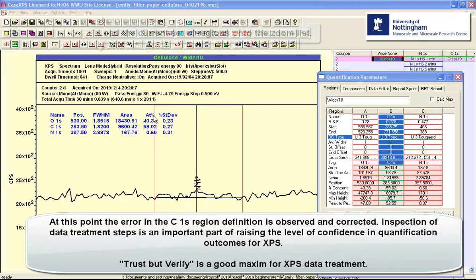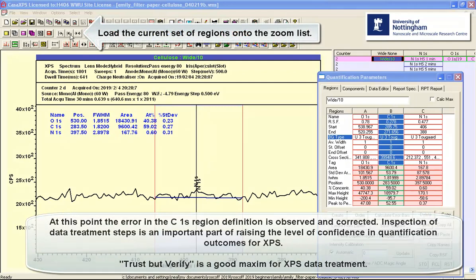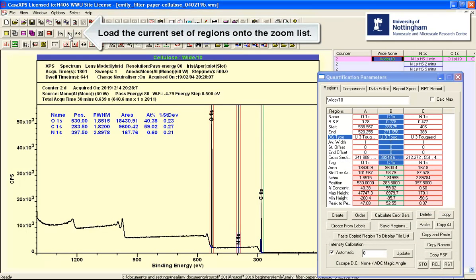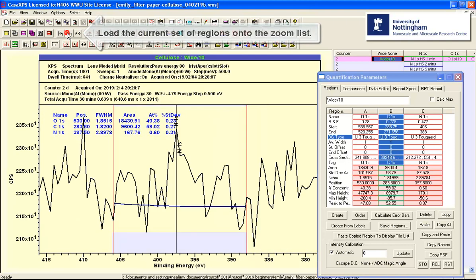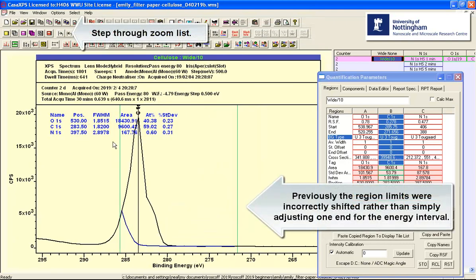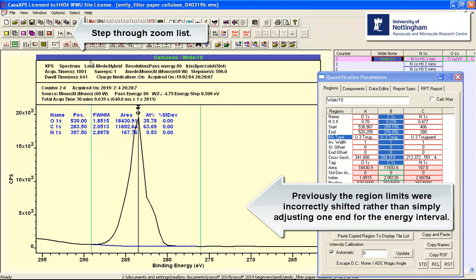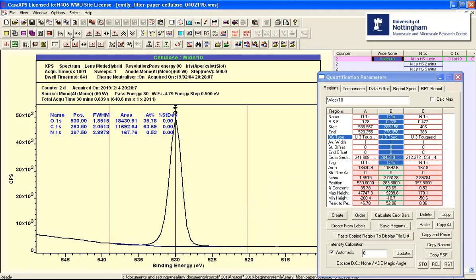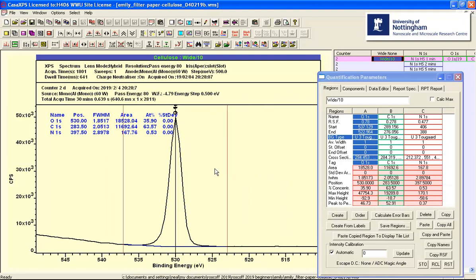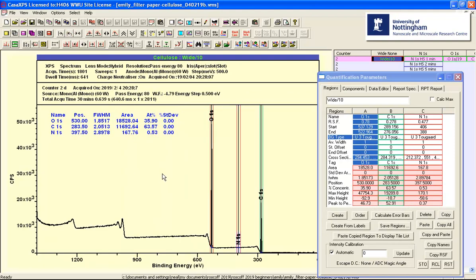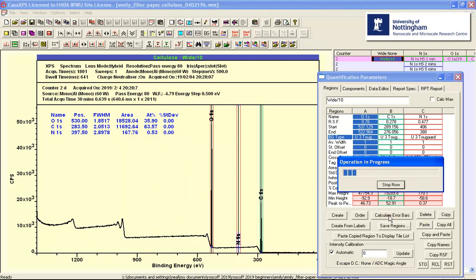So before we draw too many conclusions from this, let's just verify all these regions are as they should be. So if I load them and then slide through, well, we can see that they're not quite. So I've adjusted that one incorrectly using too large a display. So now that I have these readjusted, I'll calculate the error bars again and verify the conclusion.